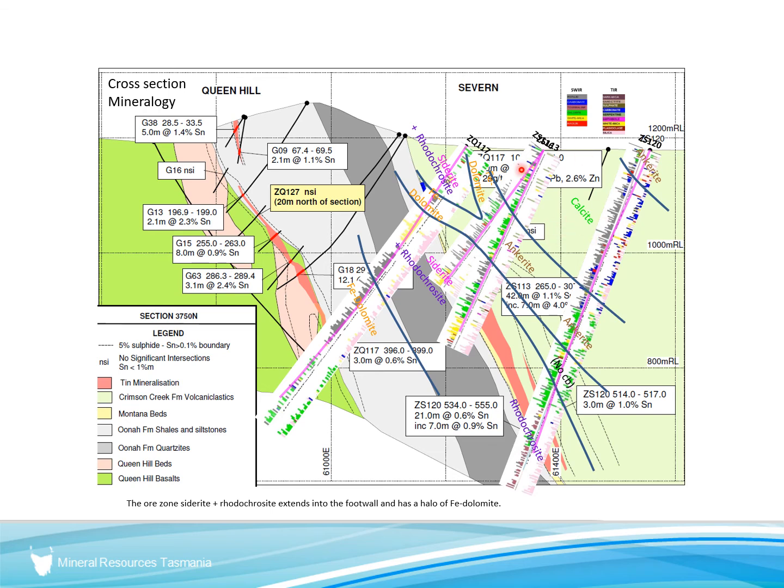So here it's calcite and ankerite, siderite in the core of the system. This red colour here is the ore system, and then going down to dolomite beneath it. So again, the carbonate, even though it might only be a minor part of the rock, can be very indicative of a lot of the hydrothermal action going on, and are easily picked up by the HyLogger, but quite difficult in the field. And because these things are a minor part of the rock, maybe not so easy to see by the geologist logging the core either.